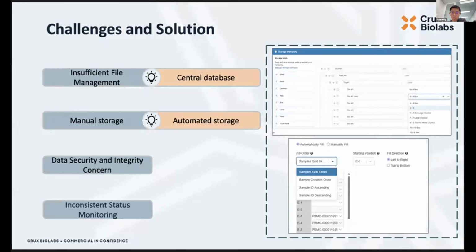It also lets us customize the box sizes, whether you're using a standard format like 9x9, or you can customize your own boxes to match your preferences.